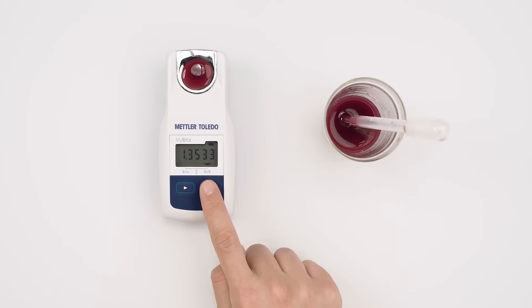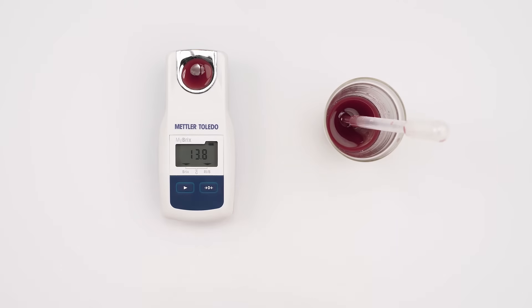To toggle through the active scales, hold the zero key and press the read key. Press the zero key to check the temperature.